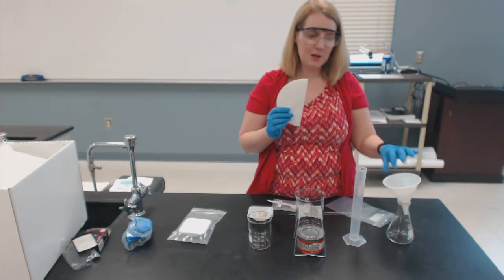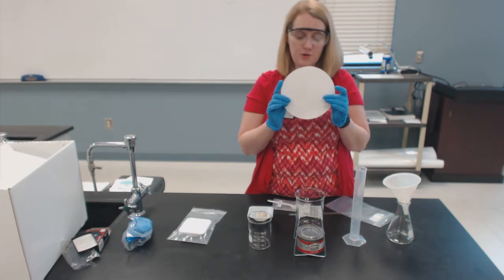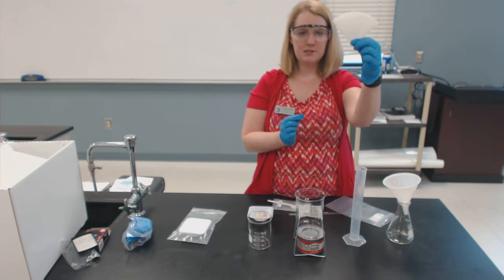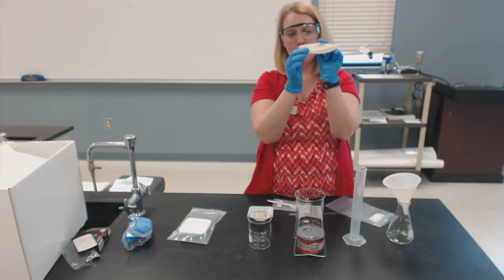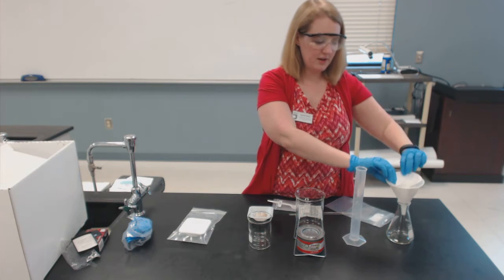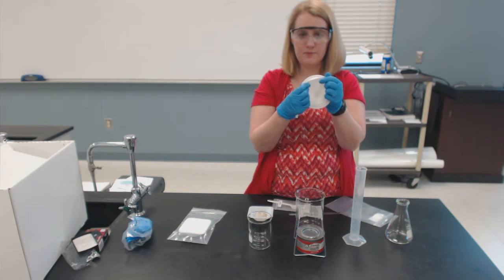Now, to make filter paper fit into a funnel, the best way to do that is to fold it in half, then fold it in half again. So you have this little pizza slice. Now, if you look at it from the side here, and you can pop open part of it, now you've got something that looks like an ice cream cone, and that will fit down in there. If it pops up, try adding a little bit of water, that'll wet it down.